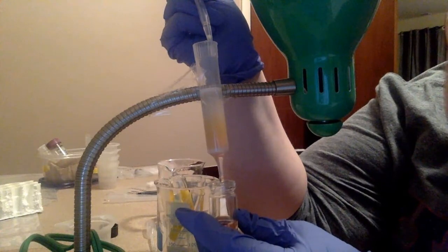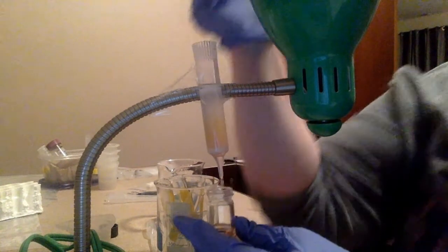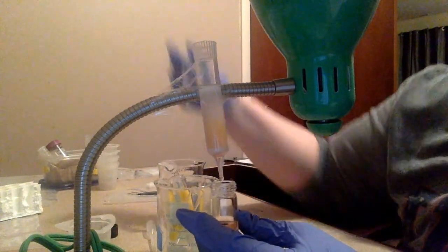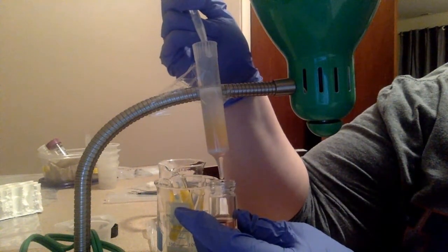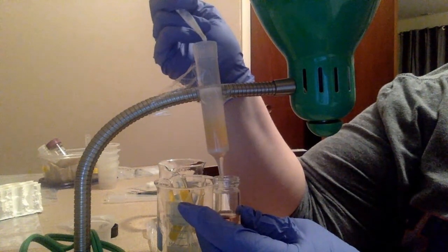And the yellow liquid at the top, the yellow would be the smallest because it's coming out last. And again, our substances are slowly working their way through the beaded matrix.